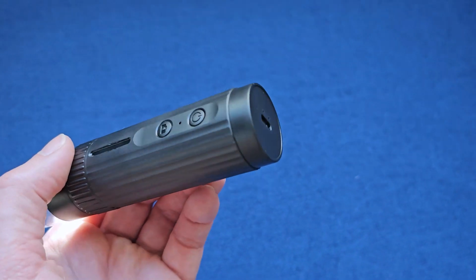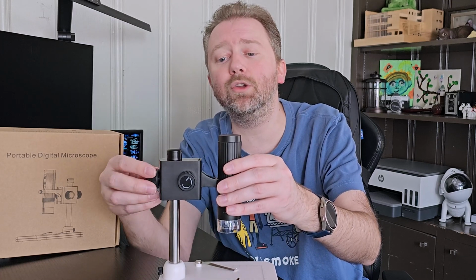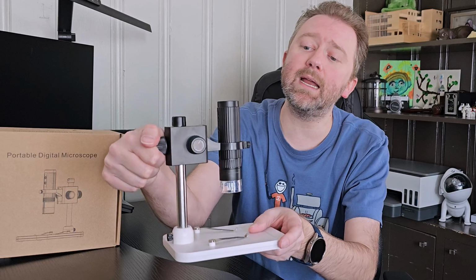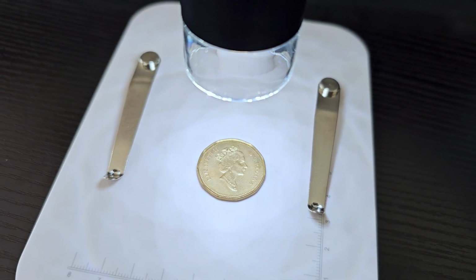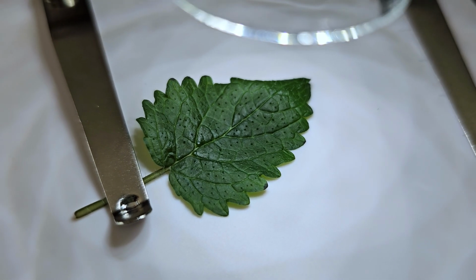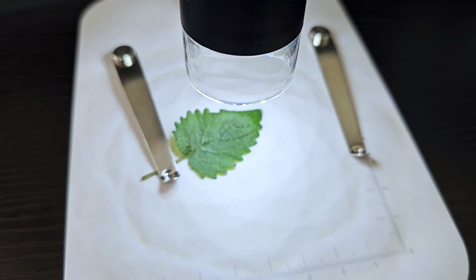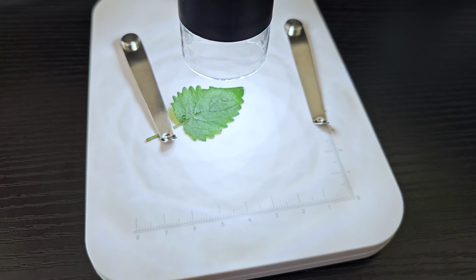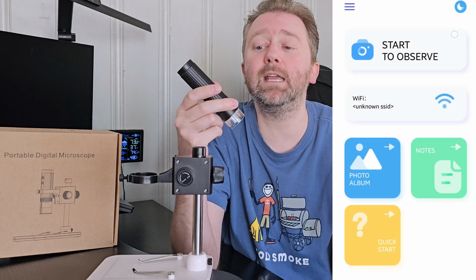So some other features of the stand, there is a dial on the back that is going to allow you to raise and lower the microscope as you need. Then there is also a side knob that is also going to allow you to raise and lower, so you can really fine tune how you wish. And then on the other side, it's going to allow you to lock it in place, so that way it doesn't accidentally move up and down. And then you have the microscope in the middle. It is removable. There is a little dial right on the front. Just go ahead and undo that, and then you can take out the microscope, which you can then utilize in handheld mode if you wish. Just note that, once again, that goes back to that shaking problem.